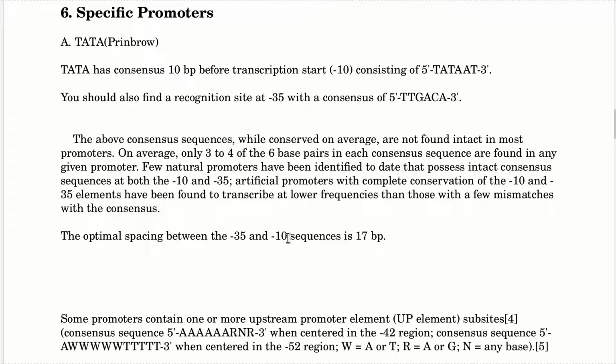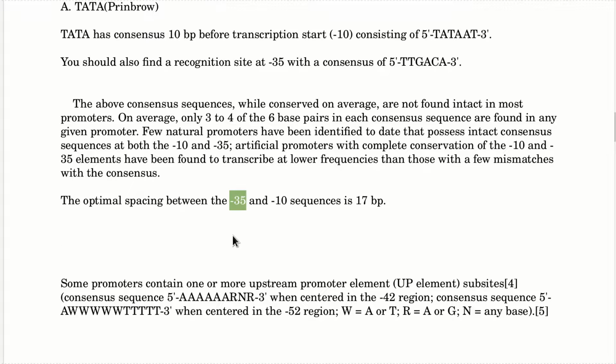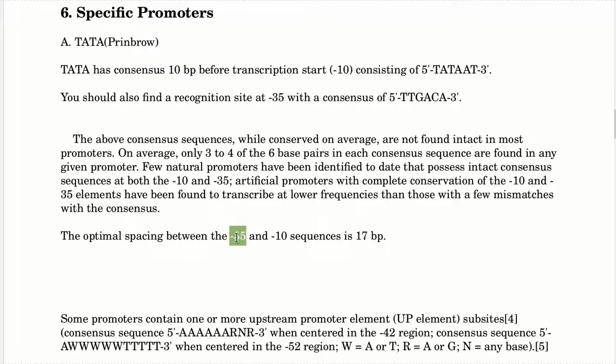So this could be anywhere from -1 to, I don't know, -15 or 20, I guess. And this one, the range could be really close. It could be much closer at even something like 15, but it could also be all the way out to -50, and that just comes from me doing a lot of these. So there's a range in there, all right?